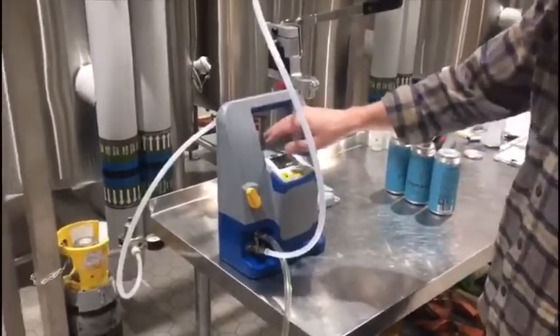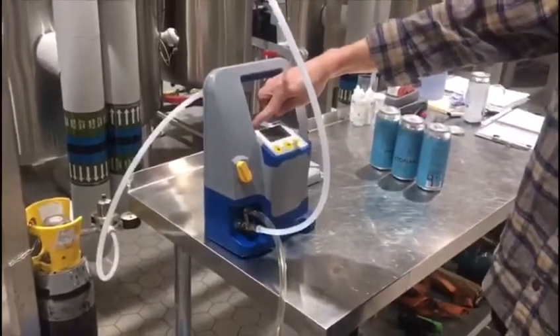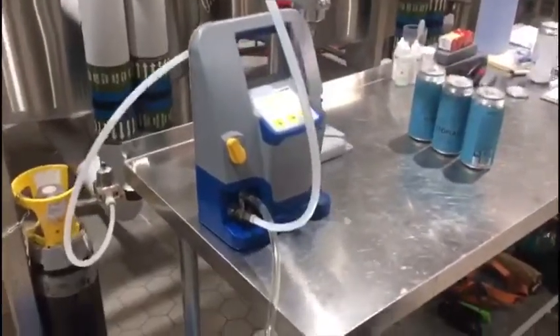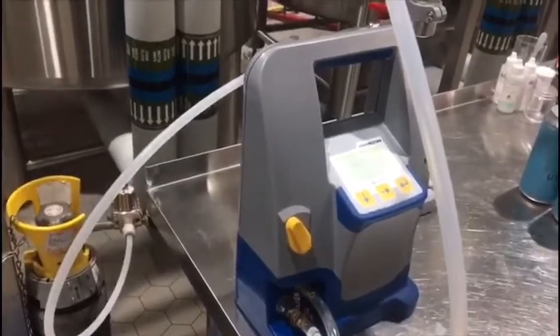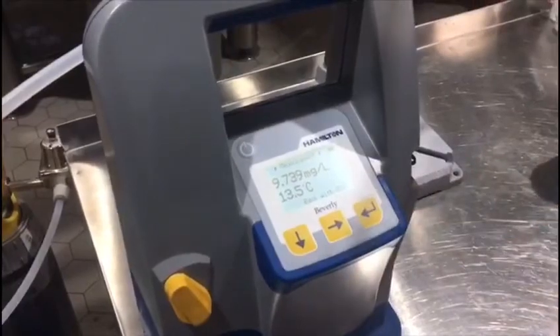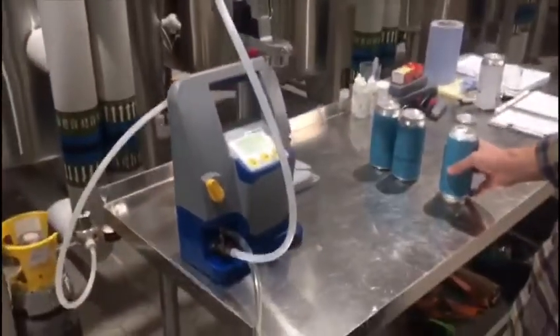We're setting up the DO meter to test cans for total packaged oxygen. We're going to start by turning the machine on — it takes about 30 seconds. We're not canning today so these cans are warm at the moment, but it should be good for a demo. We select measurement and we're in milligrams per liter, which is what we're looking for. That's our process for taking TPO from cans.